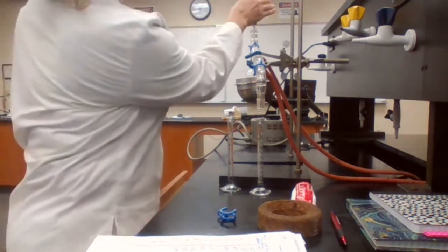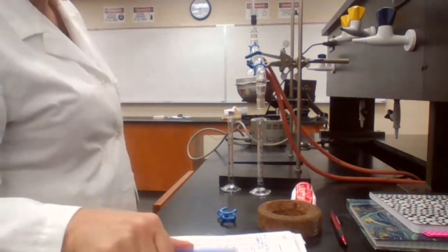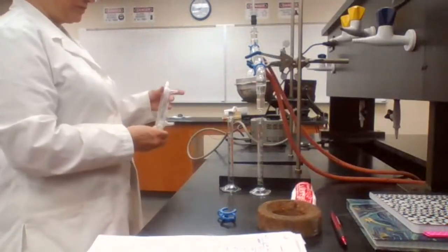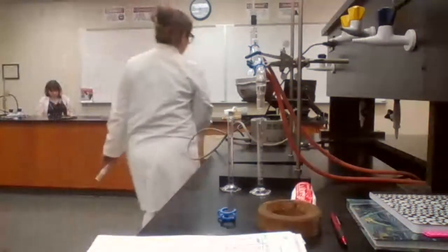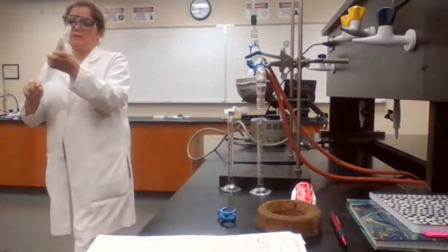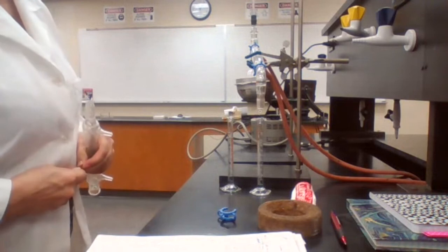Okay. 11 milliliters, 75. 12 is 75. It's not 13 yet, but the temperature stays kind of constant.